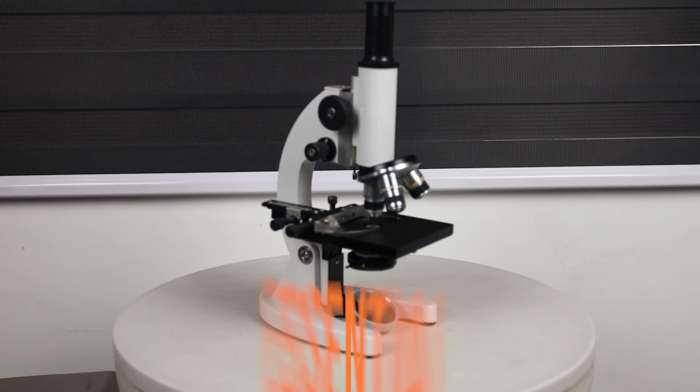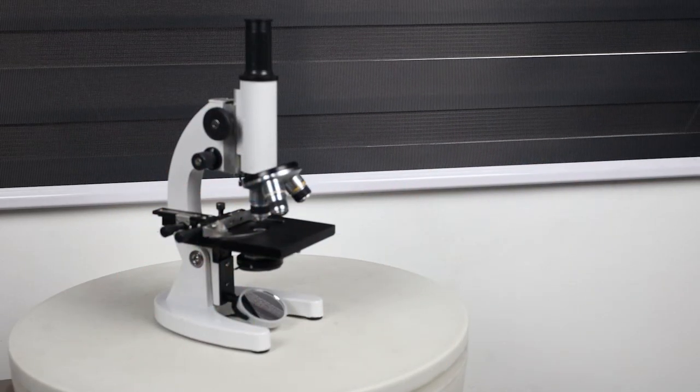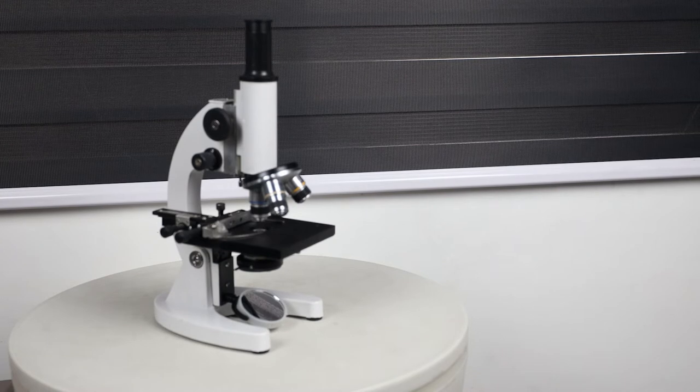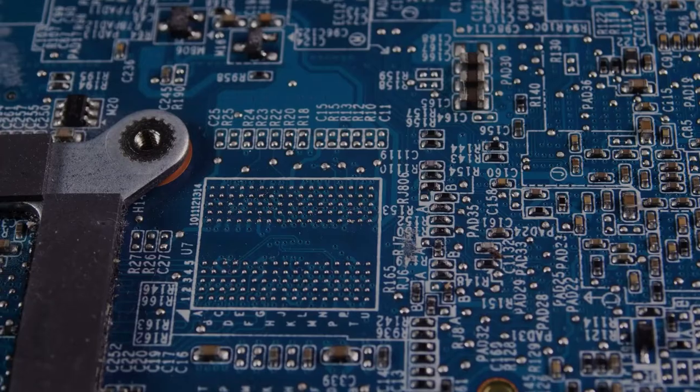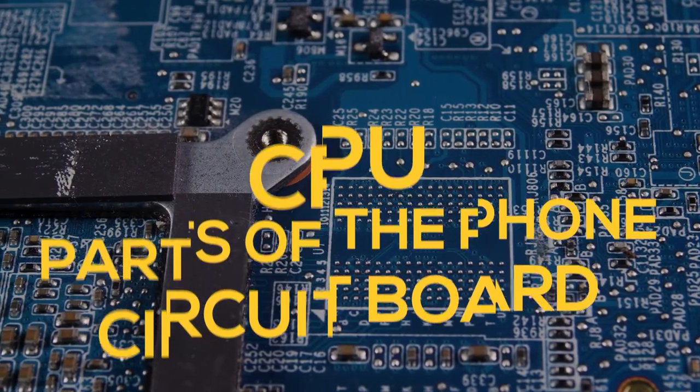A microscope is one of the essential tools to observe small specimens, not only for observing cells or microorganisms, but also to observe the small parts of electronics like the CPU, parts of the phones and circuit boards.